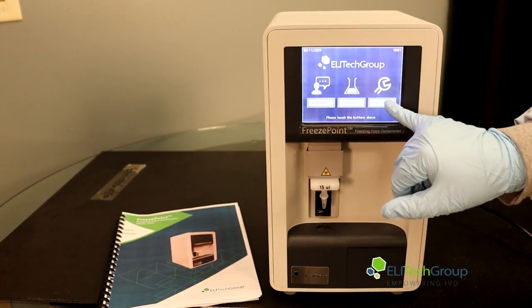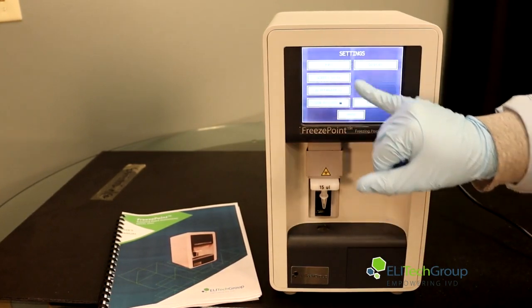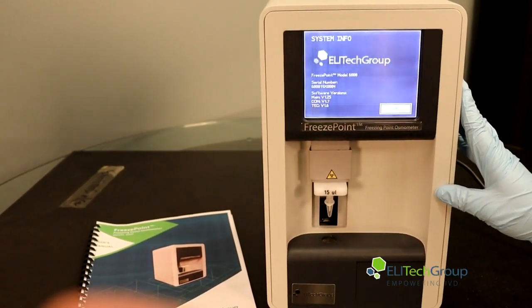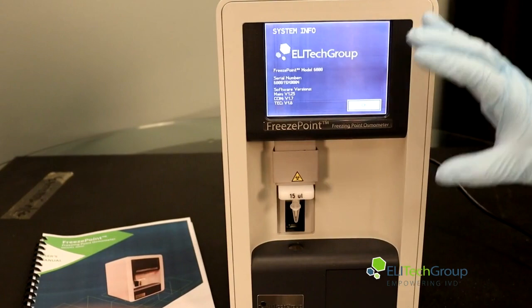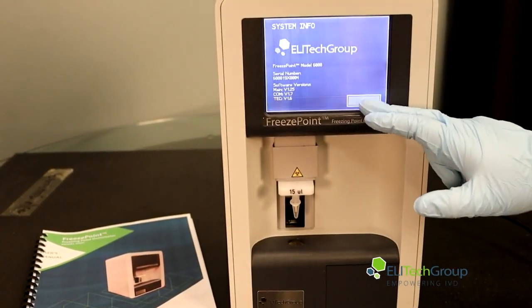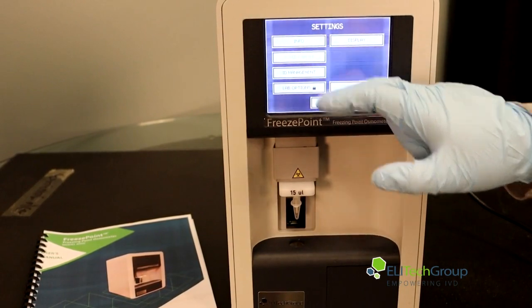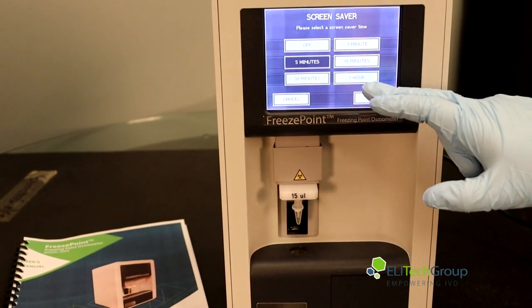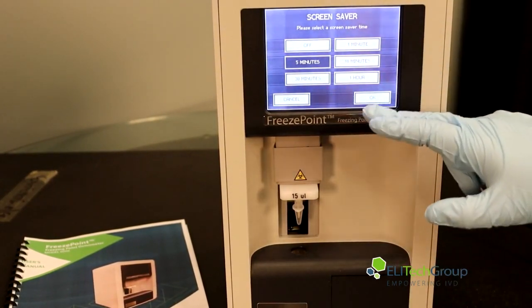Then you'll go over to your settings. You can go into info, which will give you everything about the latest version of the software and every update you've had — so you can see if your machine is up to date. You can also adjust your screensaver to five minutes, thirty minutes, one, ten, or one hour, or completely turn it off.